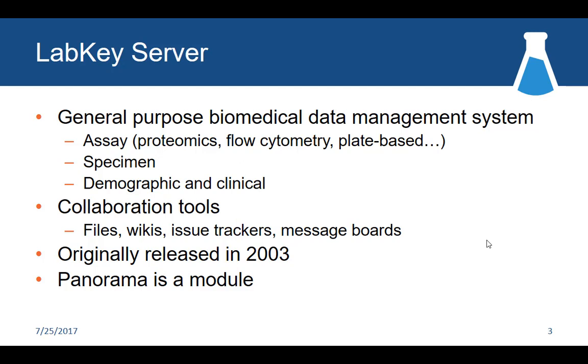It's been around for a while, more than 10 years at this point, by a fair bit. And Panorama is the targeted mass spec module, and really it's designed around Skyline. So some folks have said, oh, I've got other types of mass spec tools that I'm using, other targeted tools. We say, yeah, you want to use Skyline anyway, but we're pretty focused on that.